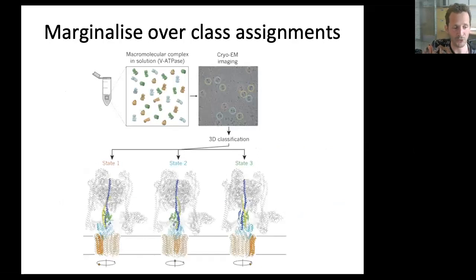Okay, so until now I've only spoken about orientations in terms of the marginalization. Now that was all based on a comment that I made earlier on, saying that we hope that all the copies of the proteins that are on my experimental grid and that I've imaged are all copies of the exact same molecule. They may tumble around in different orientations, but the molecule itself is a rigid three-dimensional object that doesn't change. Now that is very much untrue for many biological objects that we image.